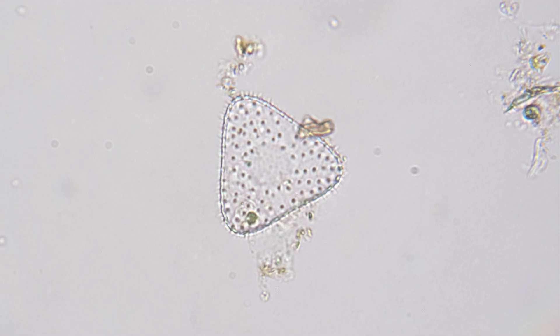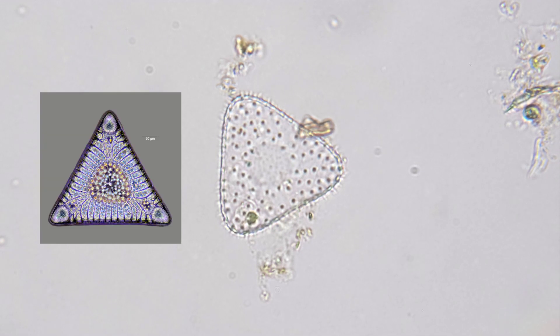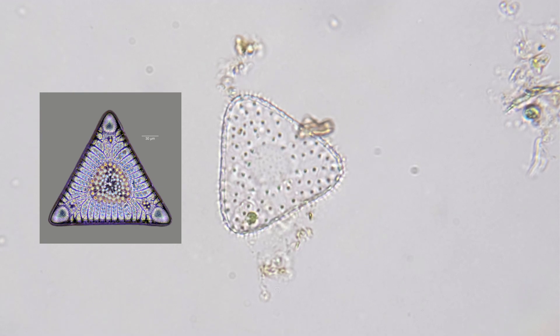Such as this one, which bears an amazing resemblance to Triceratium merlandii, though that appearance could simply be a matter of convergent evolution.